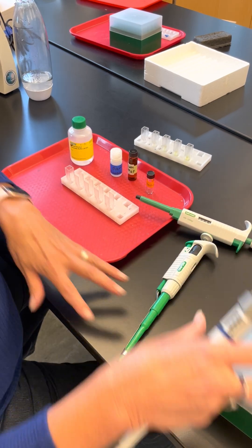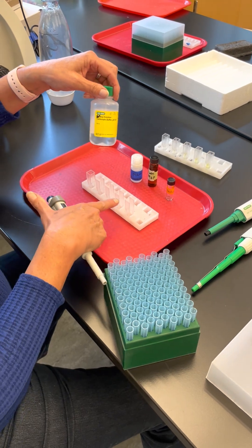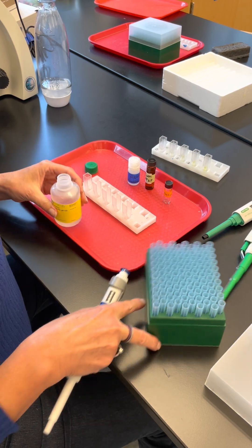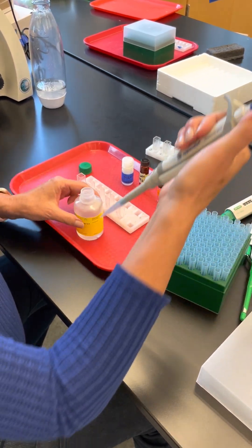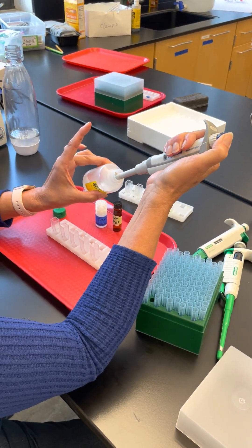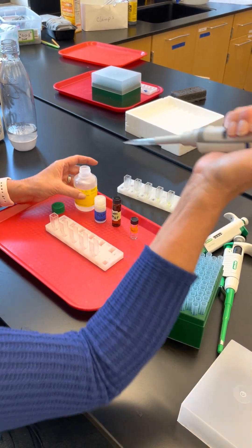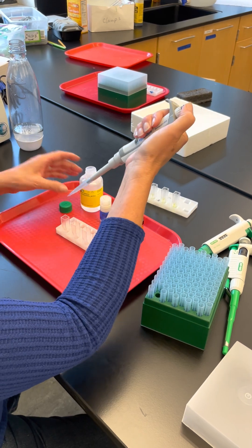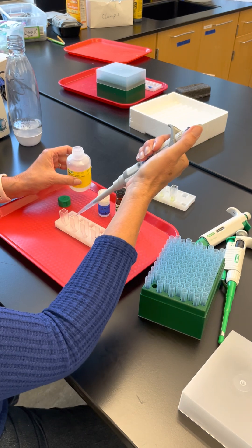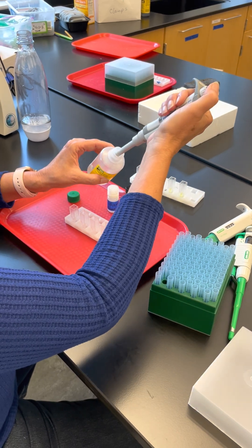The first thing we're going to do is put 500 microliters of the stop solution into each one of these cuvettes. Use a blue tip, push down to the first stop, put the tip in the liquid, and let it go. Don't pull the tip out prematurely — it takes a little time to fill, so wait a second before removing it.